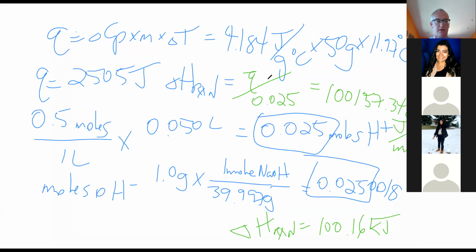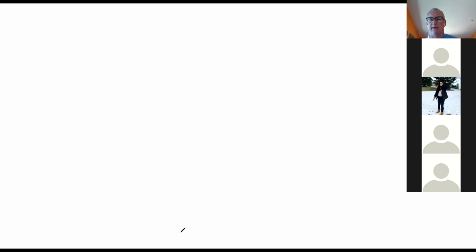All right, let's erase all this nonsense. Professor, I have a question. So for reaction 3, in the table the NaOH mass would be 0, right? You put in moles, yeah. You can just skip mass because you don't really care and just go right to moles. Okay, thank you. Yeah, that's what we're going to do now. So you guys are going to do the same reactions twice with different amounts.